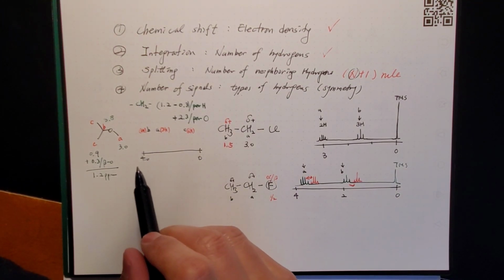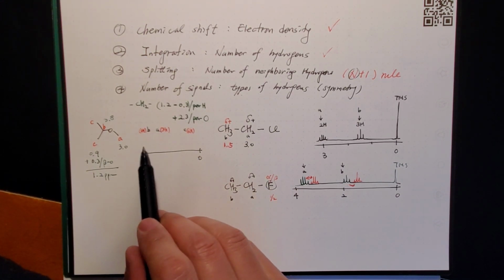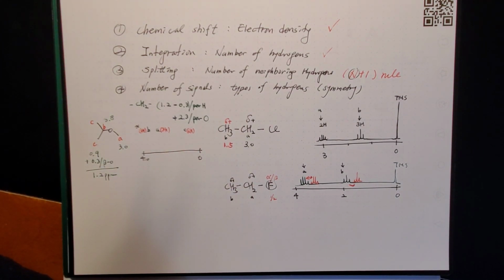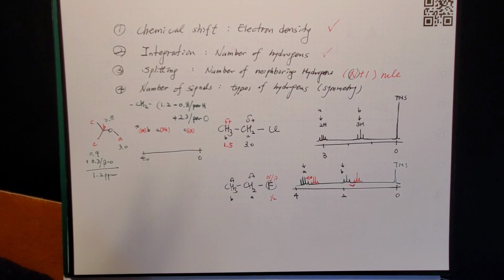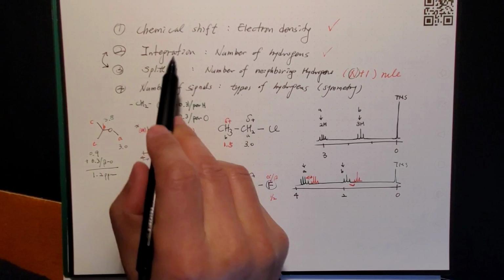So when you are drawing the height 6 to the 3 to the 1, a note you have to make here is when you have multiple signals, you have many peaks, meaning the height, as you have more and more splittings, they have an inverse relationship.